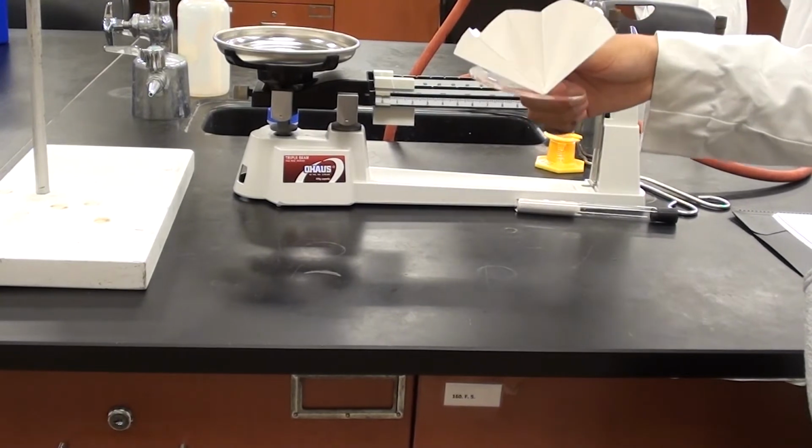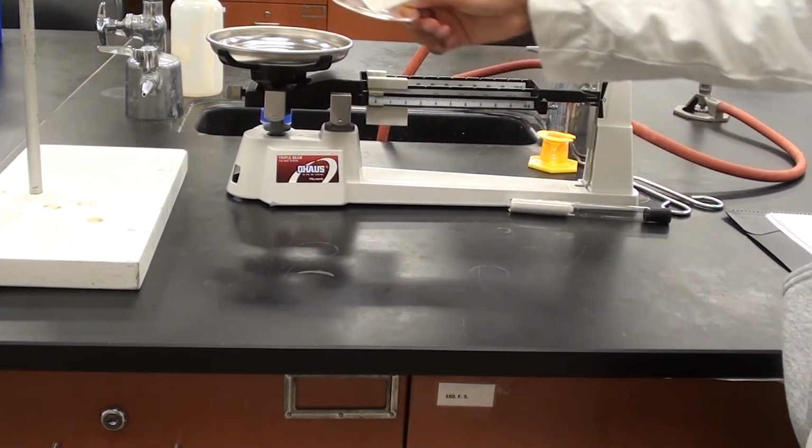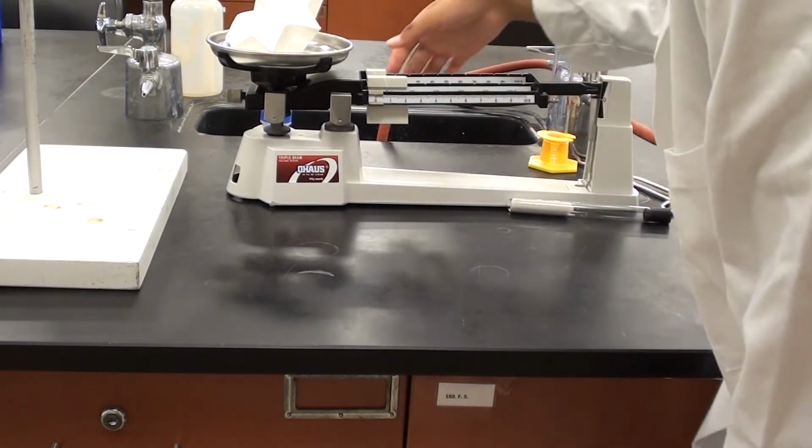So at this point, what Sabrine's going to do is she's going to weigh the watch glass and the filter paper. So go ahead and do that. And she's going to weigh both of those to 2 decimal places.